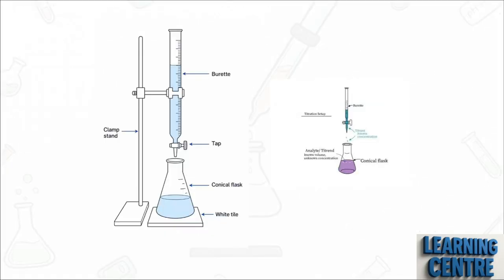And this brilliantly illustrates the secret to the burette's precision, that little tap at the bottom, called the stopcock. This isn't just about pouring liquids. This is about absolute control. It lets us accurately measure the volume, add the solution gradually, and most importantly, control the flow down to a literal drop-by-drop pace right as we get close to our crucial endpoint.